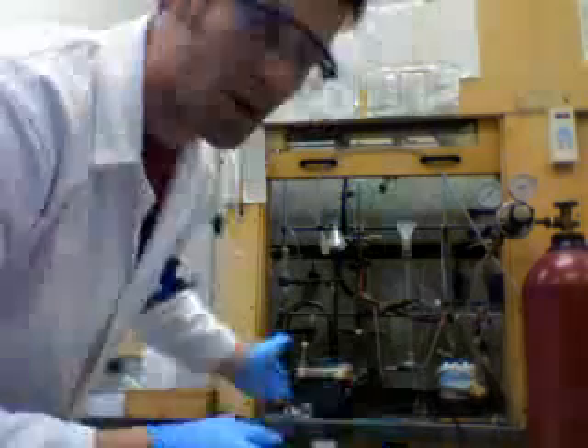Then you collect all the tubes that have your product in them, put them into a round bottom glass, evaporate, and you've properly done column chromatography. Thanks.